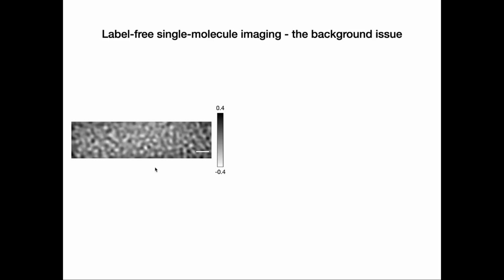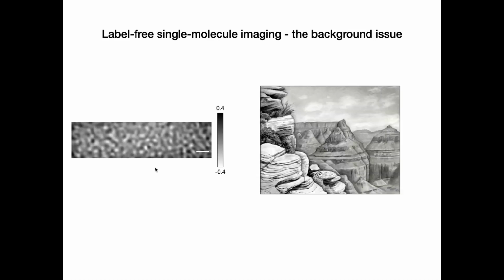So if you want to look at a protein in this scenario, it's a bit as if you would look at a very tiny stone that you try to make out in a mountain landscape. If I now throw a little stone into the bushes next to these rocks here, it's really hard to make out this event or actually look at the details of the event.